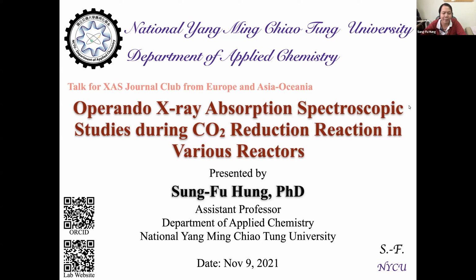So this talk is about the operando X-ray absorption spectroscopic studies during carbon dioxide reduction reaction using various reactors I designed.